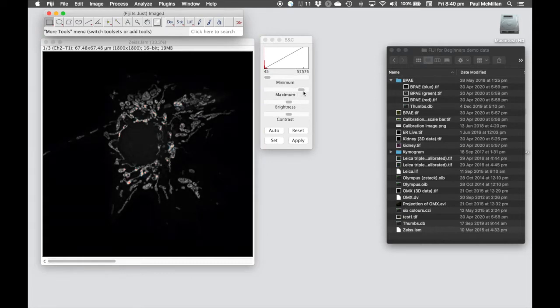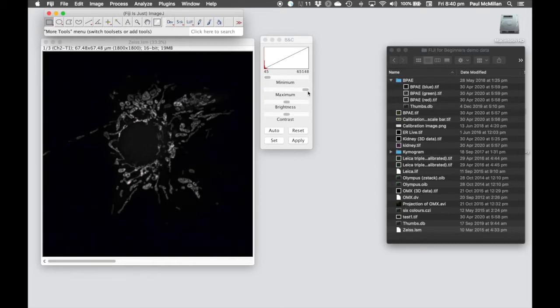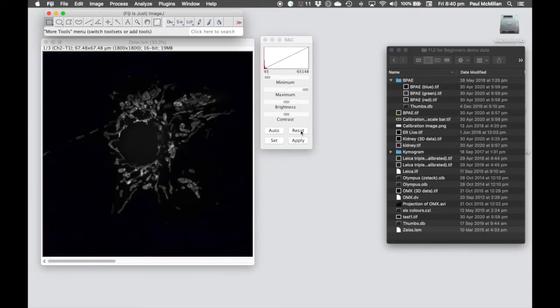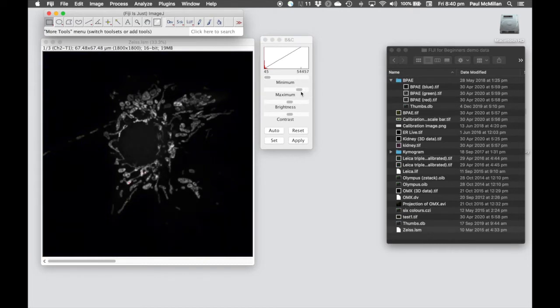On the maximum side, if we decrease this down, you'll see we come to a point where we start getting red pixels where we're actually saturating the image. This image looks like it was taken with most of the dynamic range. One thing to be very wary of is the Auto function — it can do some very strange things to your image quality, so be very careful about using it. Here we're going to reset.